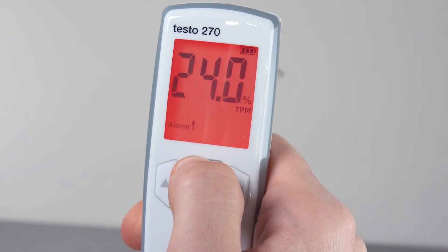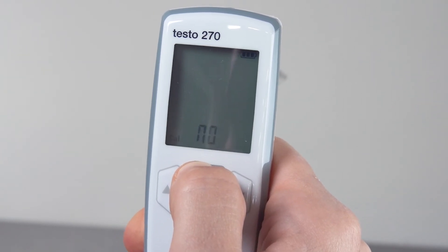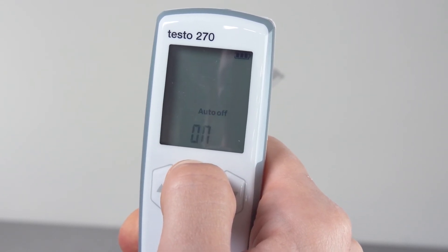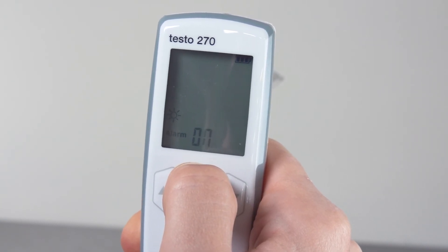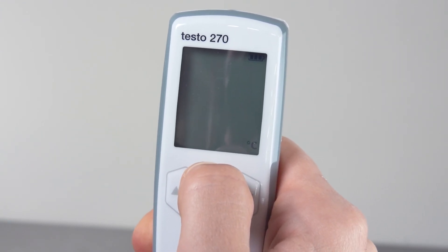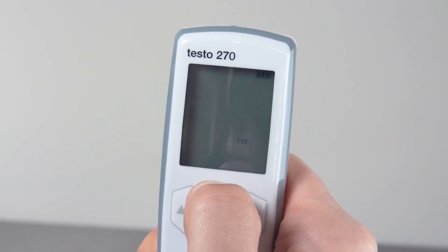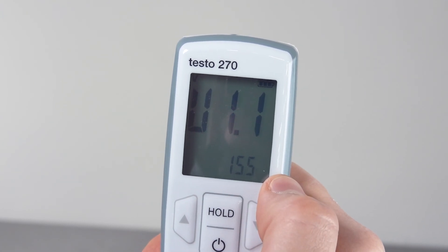These settings can be found in the testo 270: set the lower TPM limit value, set the upper TPM limit value, carry out a calibration, automatically hold measured values, activate or deactivate automatic switch-off, activate or deactivate alarm lighting, select temperature unit, activate or deactivate PIN protection, carry out reset, show firmware version. Press hold to exit the menu again.